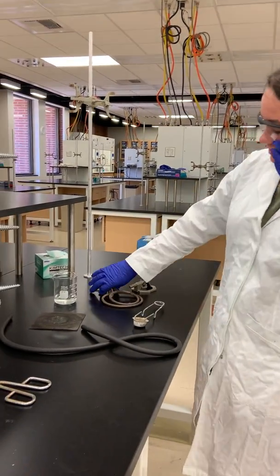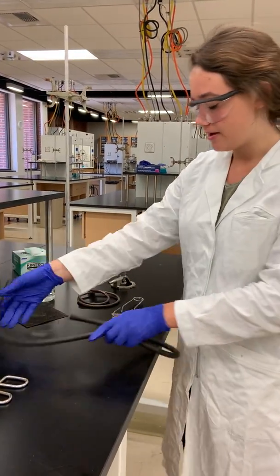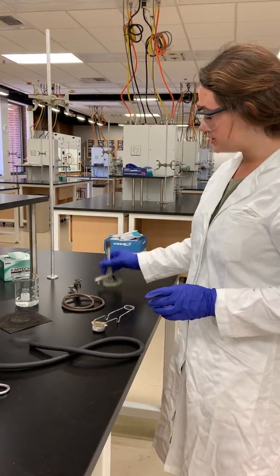Here's all the equipment we need for this lab. These are the ring stands, this is the wire gauze, this is the rubber pipe, this is the striker, and this is the Bunsen burner.